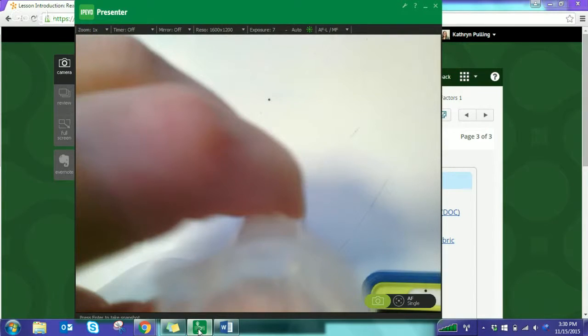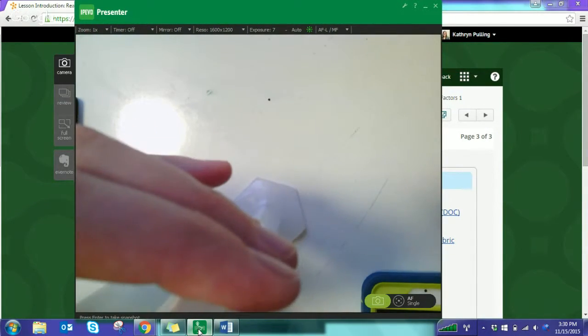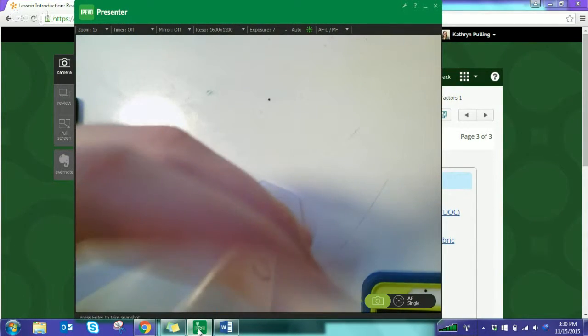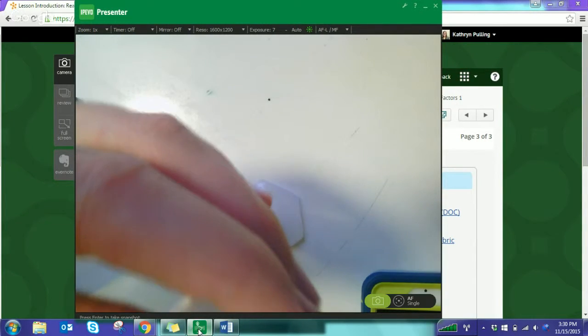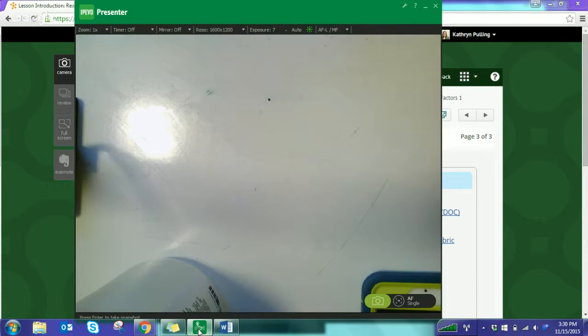All right, based on our studies of molarity, the concentration is moles divided by volume, right? If we don't add any extra A chemical in there, but we increase the water, we will decrease our concentration. So that's something you have to keep in mind as our times change. We're leaving the concentration in this sample of C alone, but we decrease the concentration of A. So what do you think is going to happen time-wise?